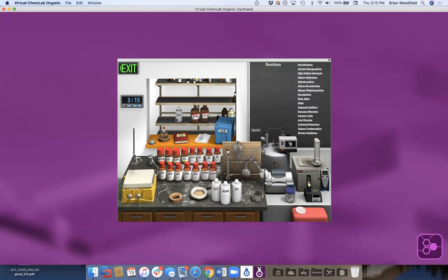So all of the labs are the same in that they all have stock rooms, they all have lab benches, equipment. They're all different because you do different experiments. So in this lab, we have where the reaction happens. We have the setup in the stock room, and then we have all of our analytical equipment over here to analyze products. And each one of these named reactions creates a set of starting materials, all right?